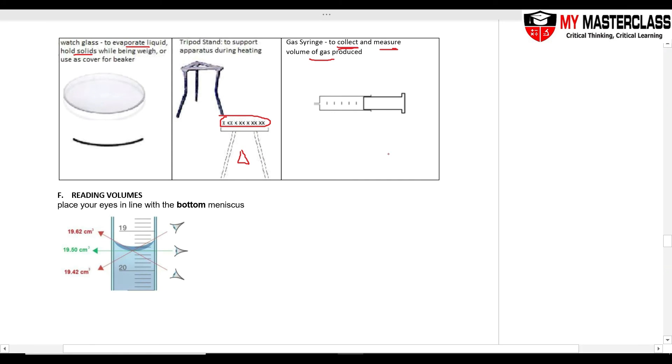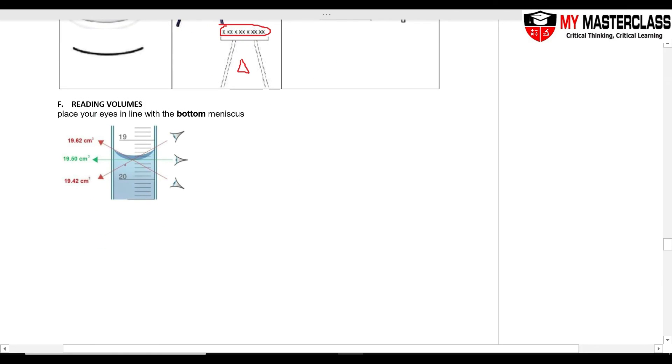Reading volumes of your liquid, always read the bottom meniscus, and then it must be in line with the bottom meniscus. If you read it from here, if you read it from here, all these are all parallax error.